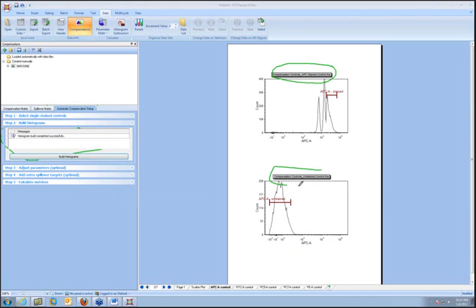Okay, so it automatically chose the same parameter from the universal negative and from your positive control, and so you don't have to do anything. So you just flip through, check to make sure your markers are in the spots that you want to use them for. I'll make this one a little bit wider here.